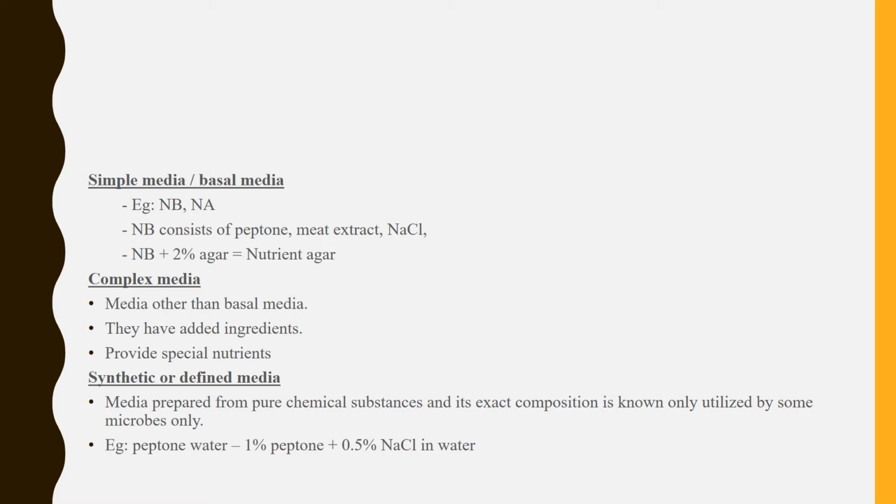So second is complex media. Complex media have added ingredients into the basal media. So why do we add other ingredients in the basal media? To provide the special nutrient for the special microorganism which do have some special requirements for their growth.